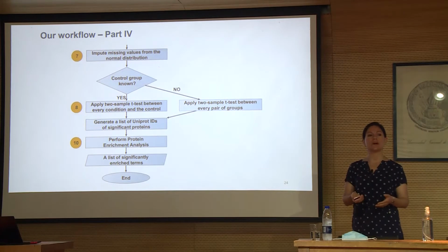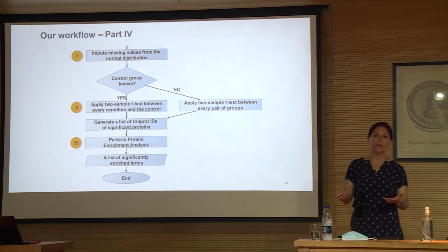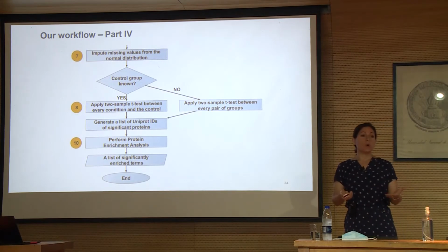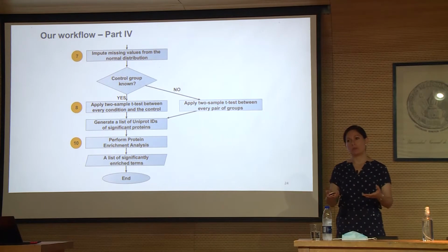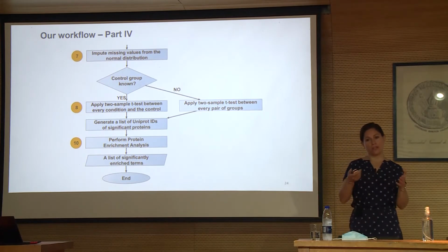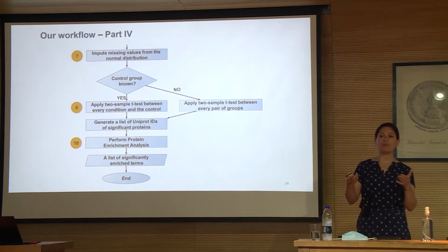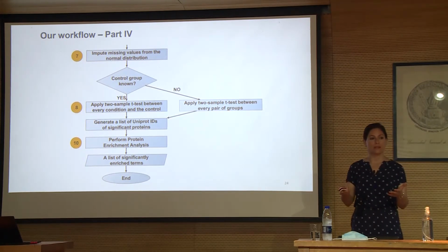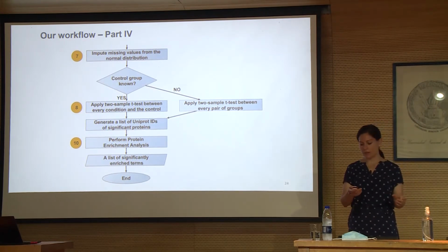So it is about now looking at which proteins are altered. Sometimes if you don't know what is the control and what is the treatment, you are not able to know if your protein of interest is significantly altered, if it is upregulated or downregulated. But that doesn't matter. You still have that protein that is altered and regulated.